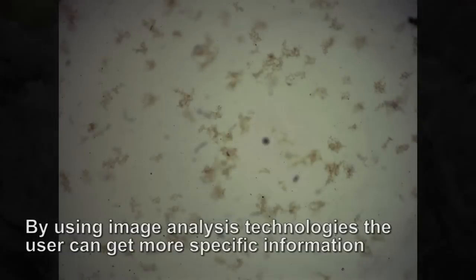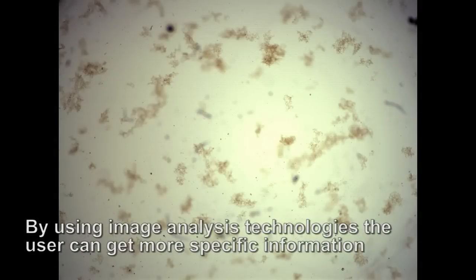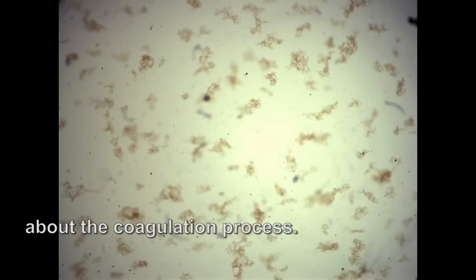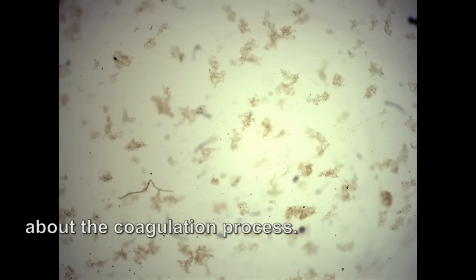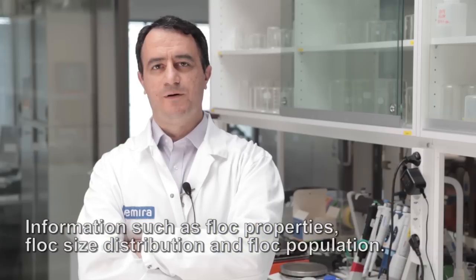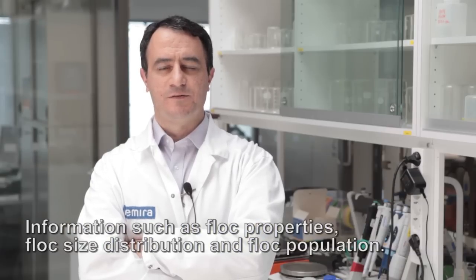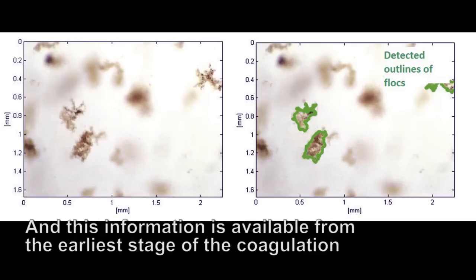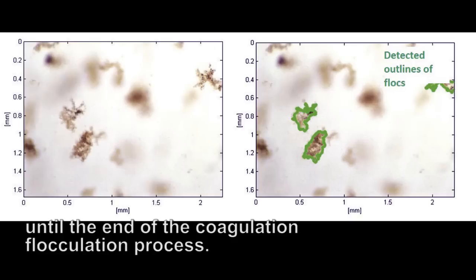By using image analysis technology, users can get more specific information about the coagulation process. Information such as floc properties, floc size distribution, and floc population. This information is available from the early stage of coagulation until the end of the coagulation-flocculation process.